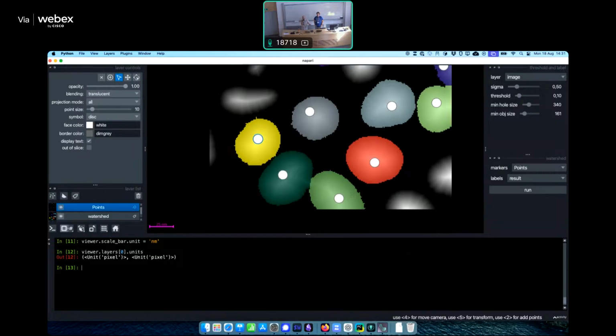but the most common plugin that people develop is a reader plugin, which is exactly that. You just create a function that can go from a file to Napari layers, and there you can do whatever you want, essentially. So if your file has metadata information, you can then give it to Napari. At this point, if you provide units, it will be used in some cases, like you were saying, not always.